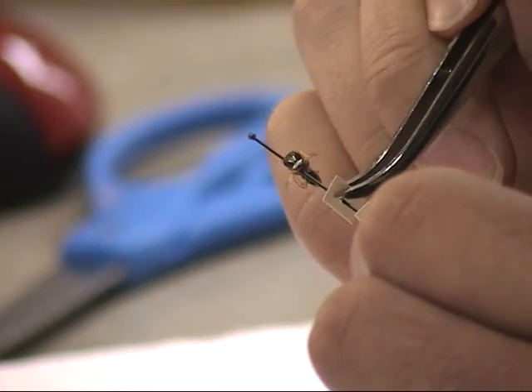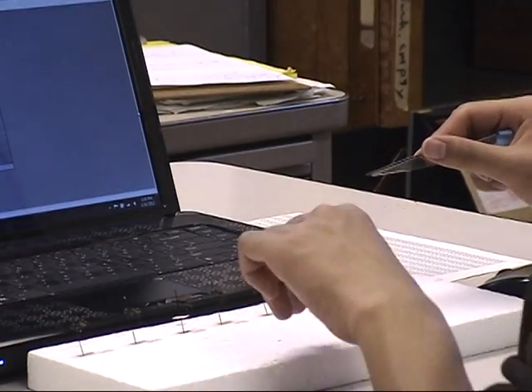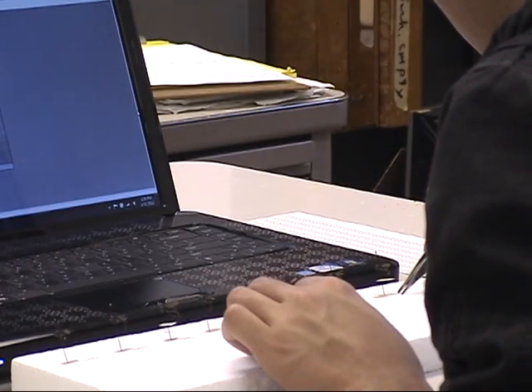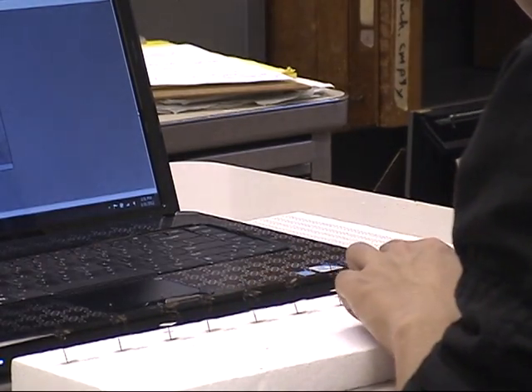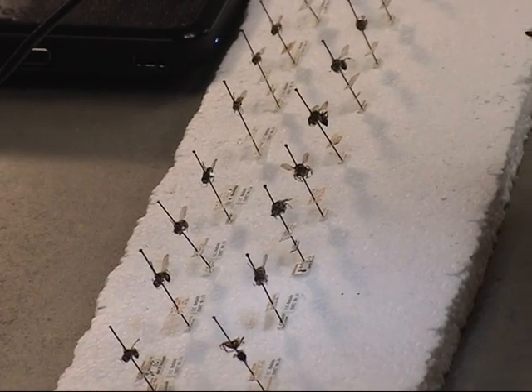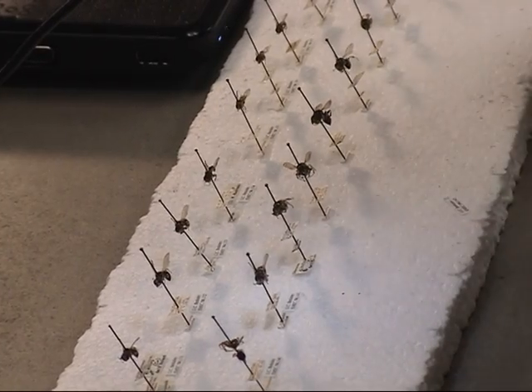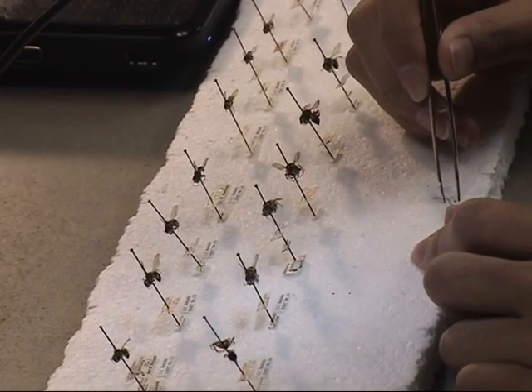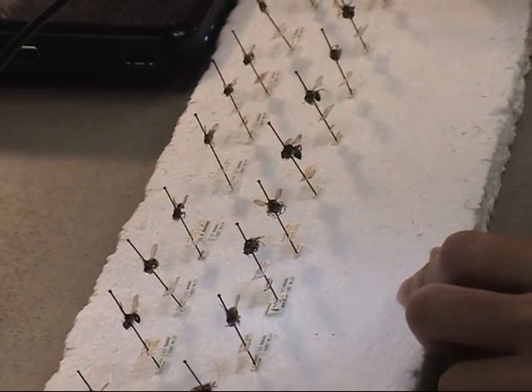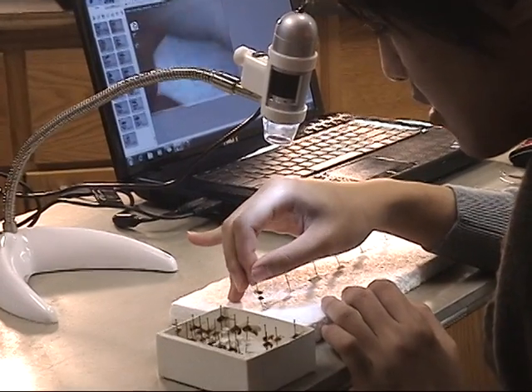Or, you may need to temporarily remove labels from the pin and lay them in front of the specimen for all to be clearly visible. Please note: if you must remove labels, place them in the original order as they were on the pin. Labels should not be shuffled around or reordered. Be aware that if you knock or drop labels that are removed from the pin, it may be impossible to determine which labels belong to which specimen, so please be careful.